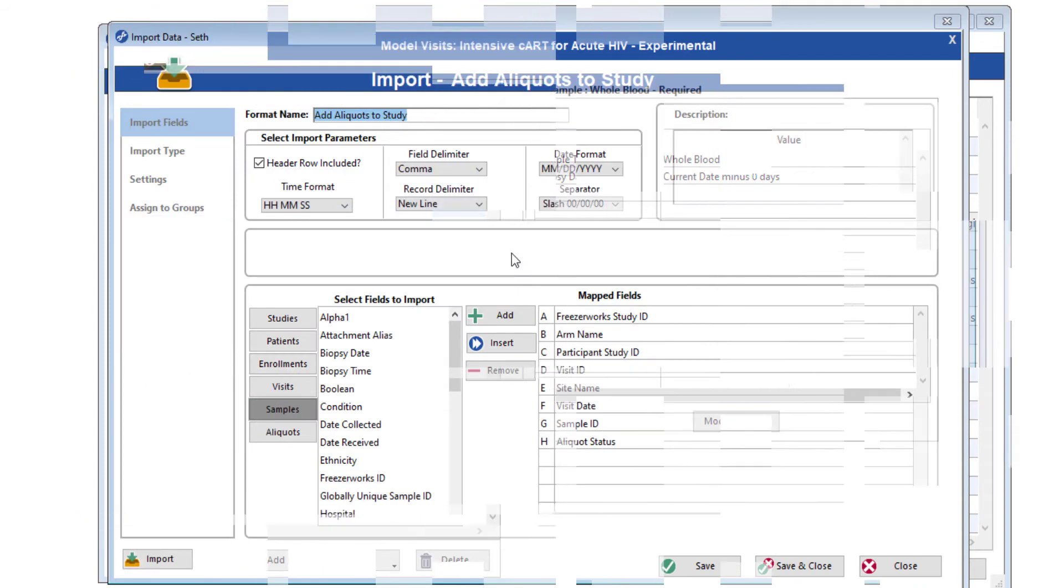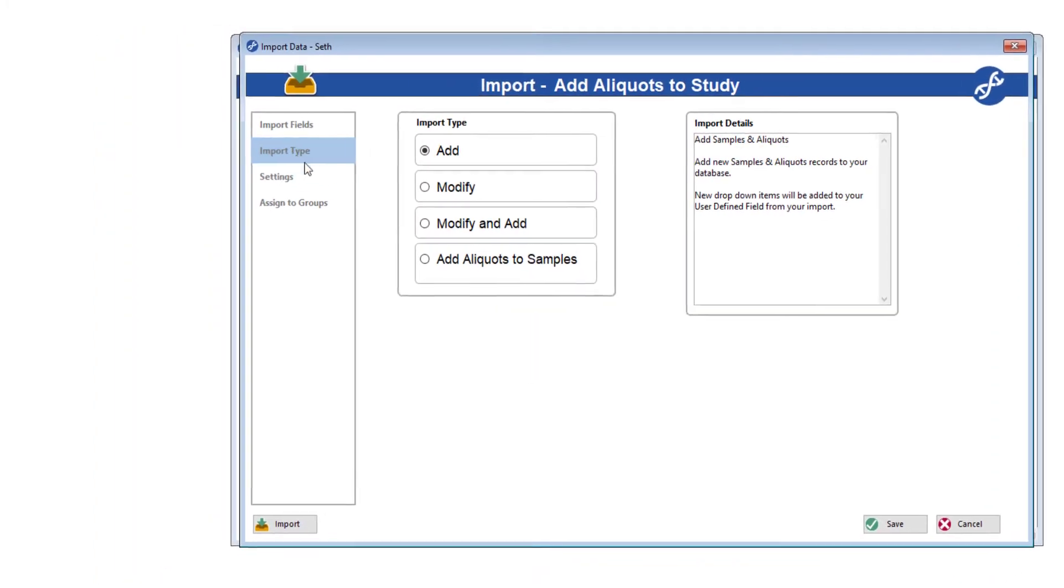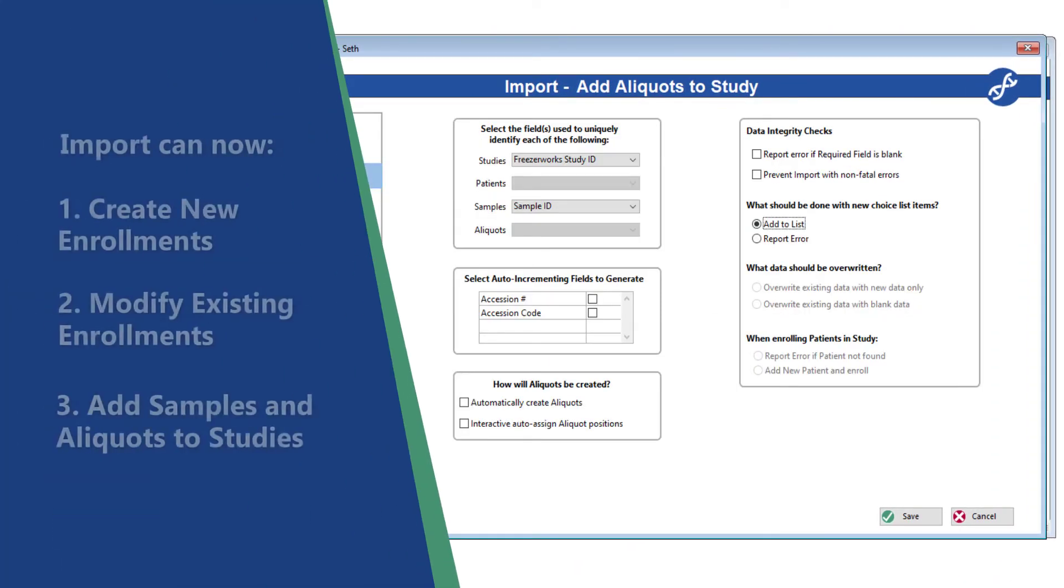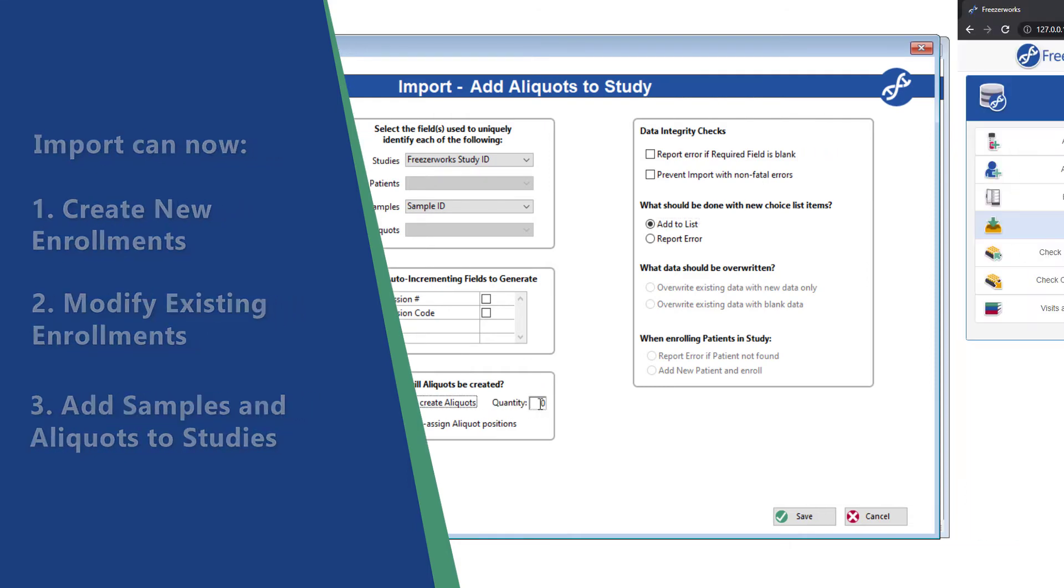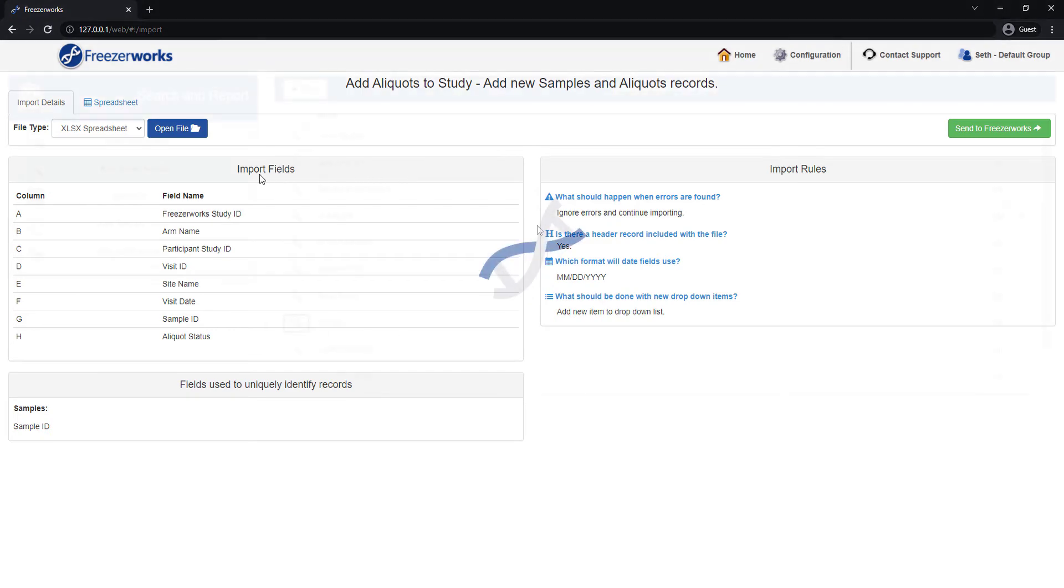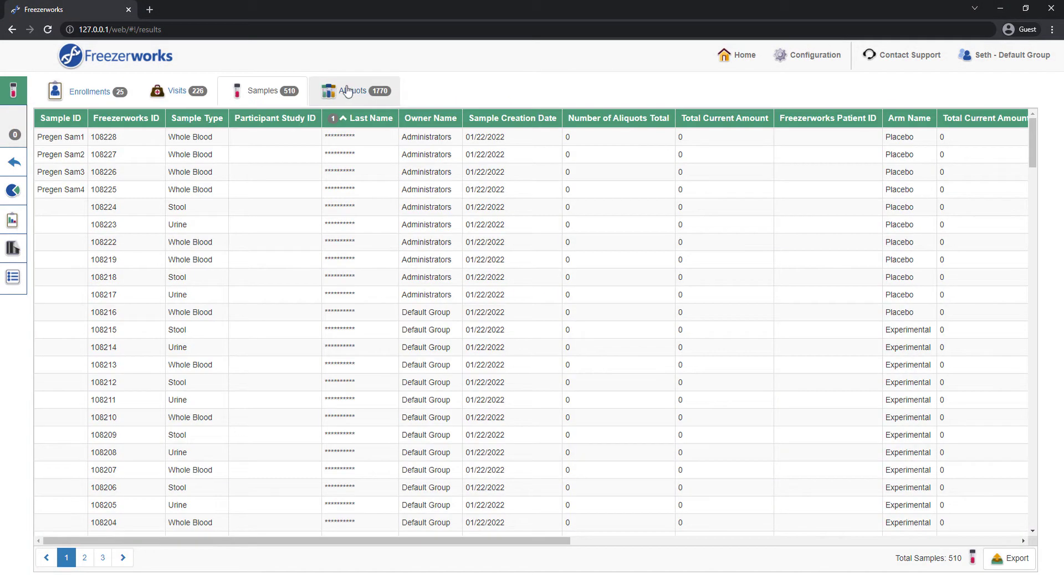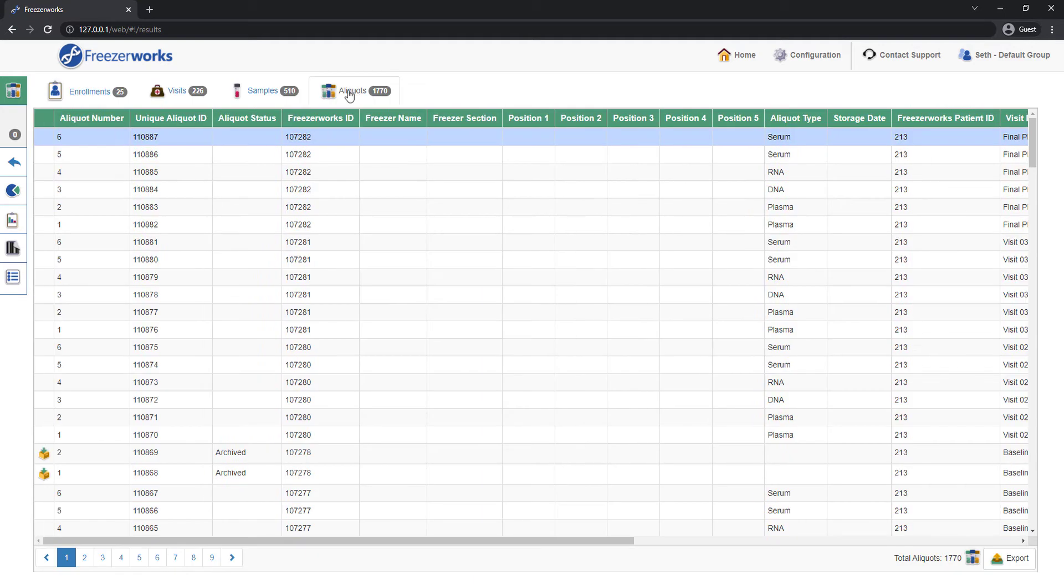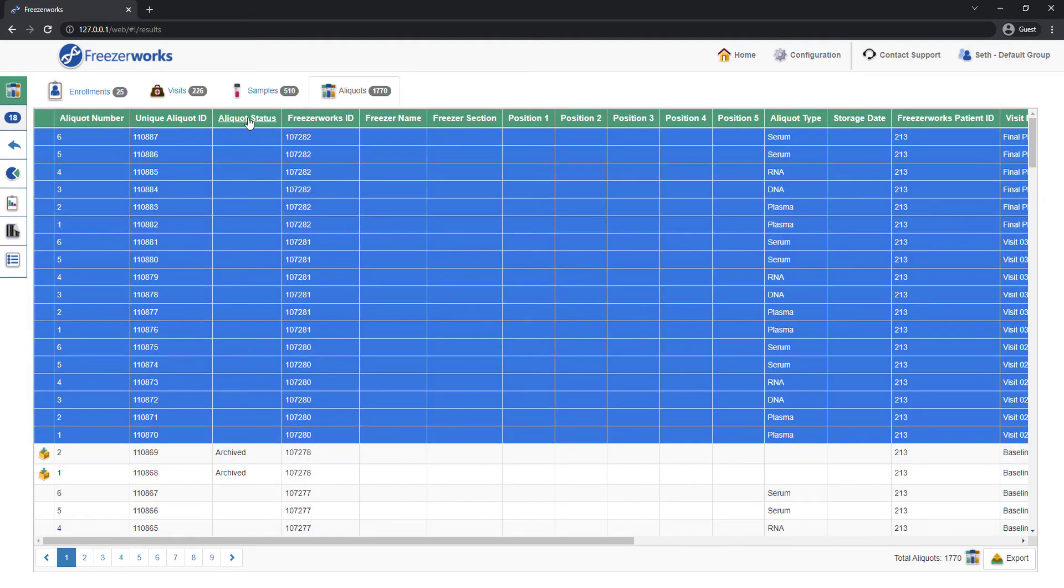Lastly, our powerful import tool can now be utilized for large-scale study management work, including creating and modifying enrollments and adding samples to studies. The updates to import and the additions of enrollments and kit management can all be found in the web as well as the desktop client. But study configuration and modeling visits are still exclusive to the desktop.